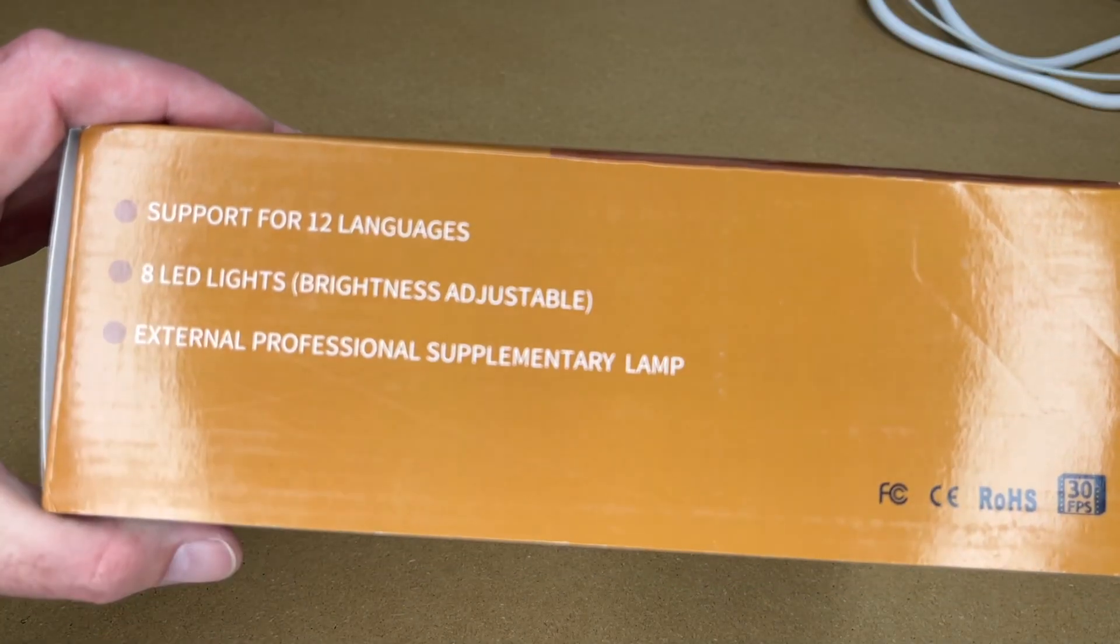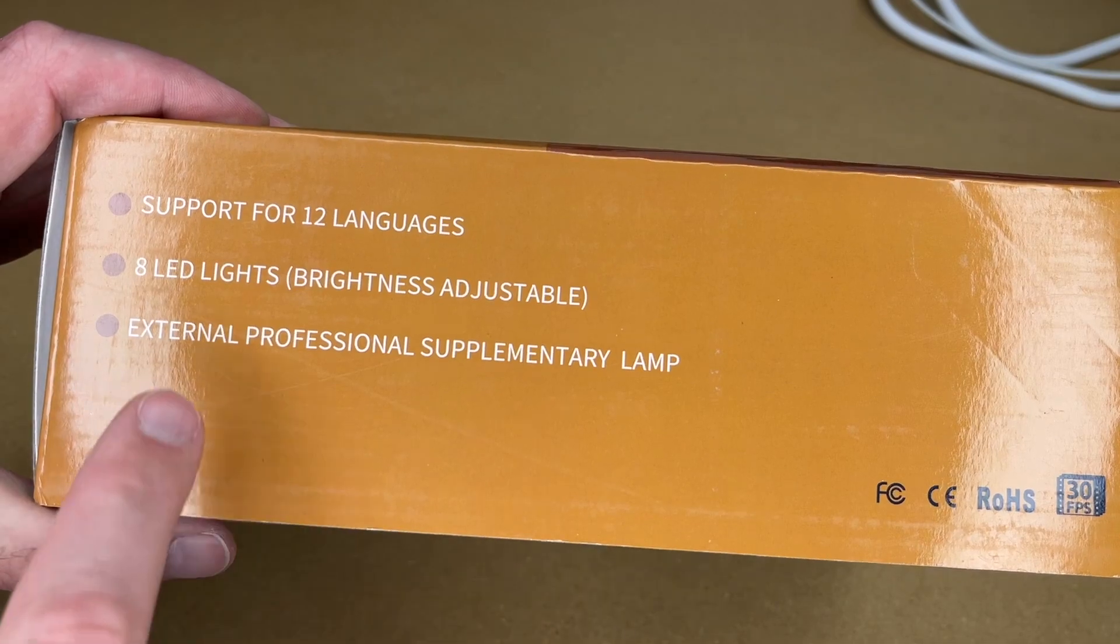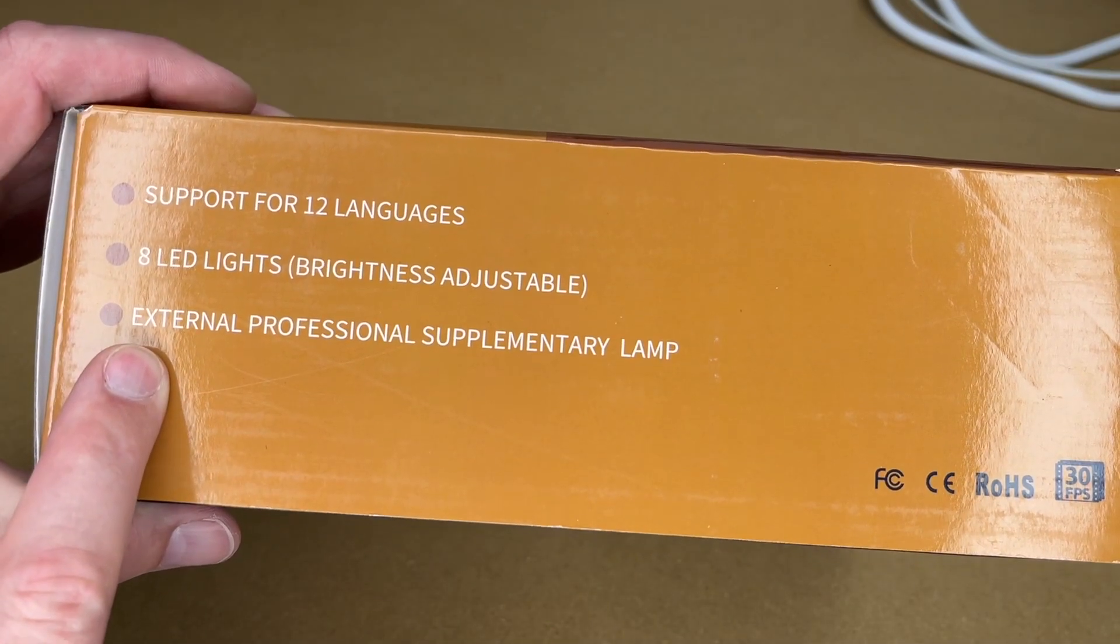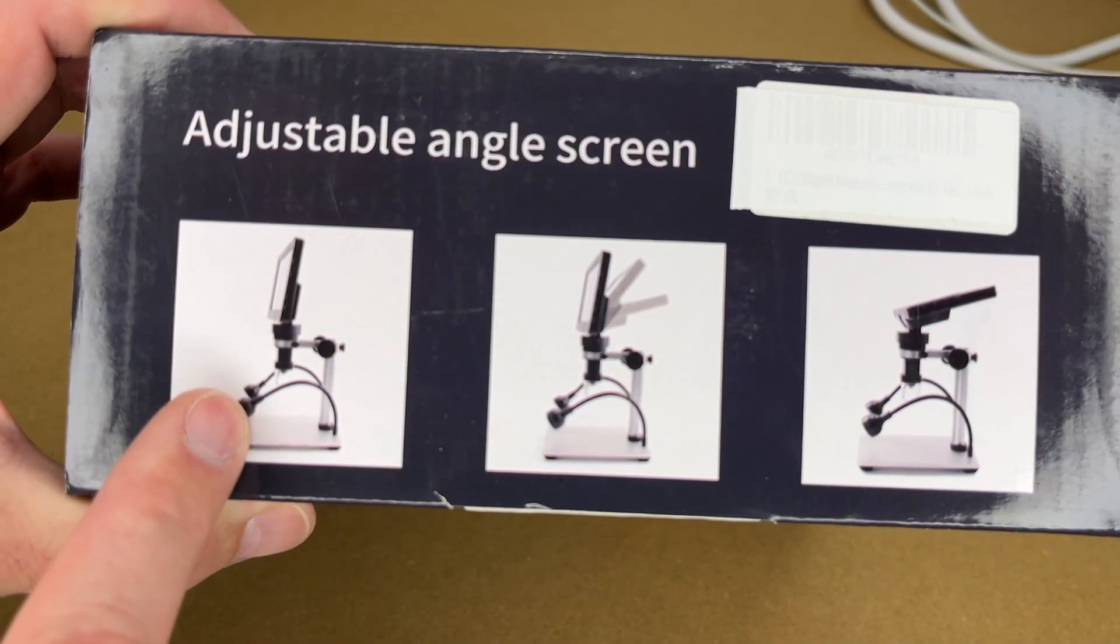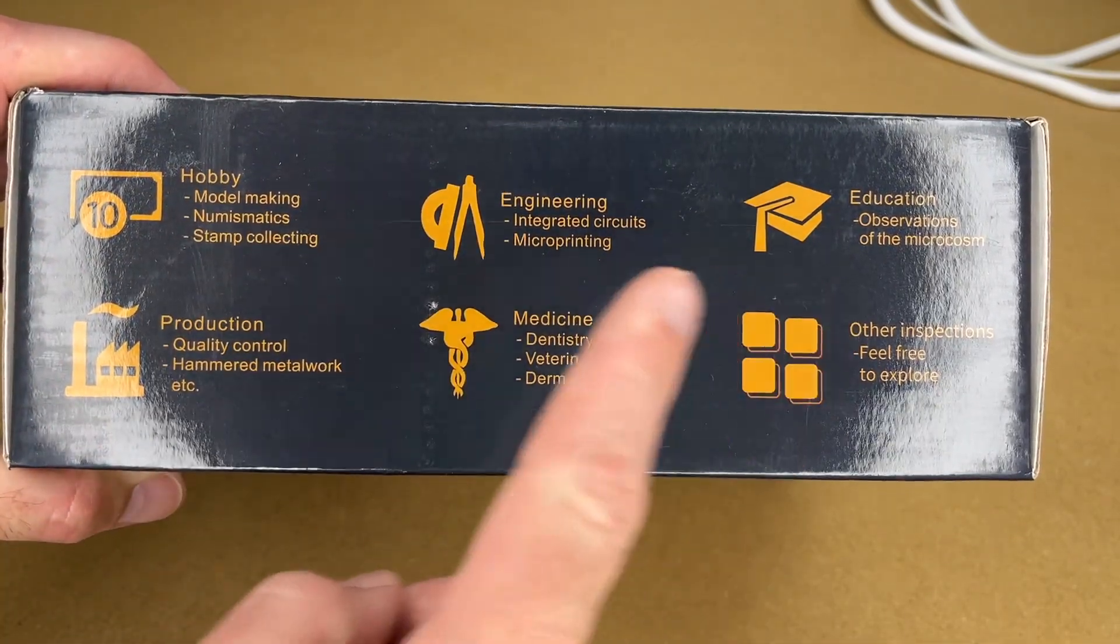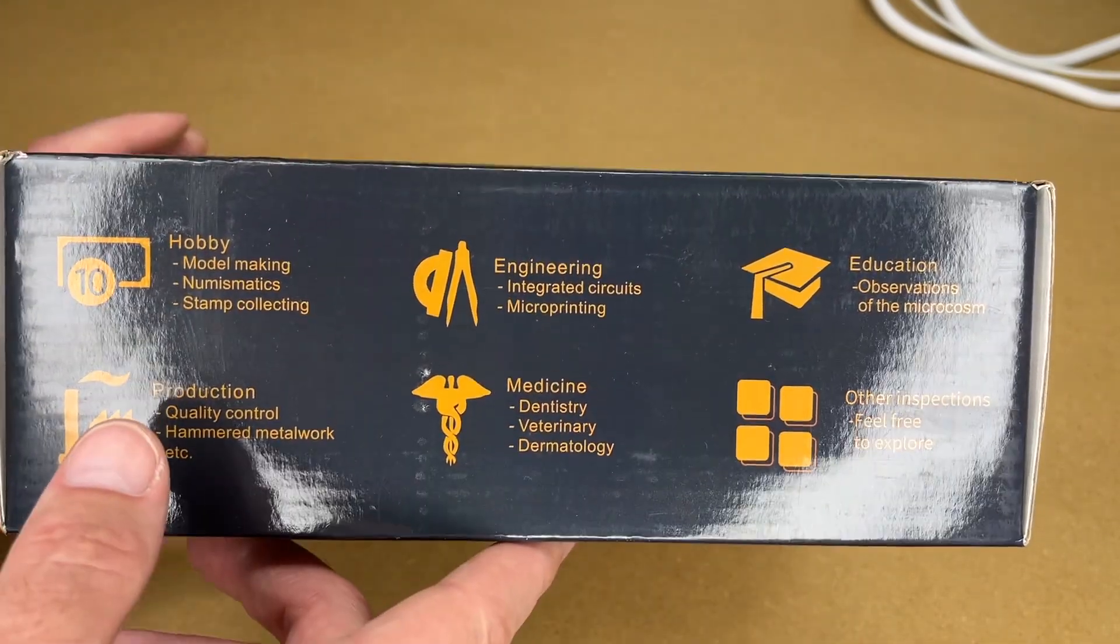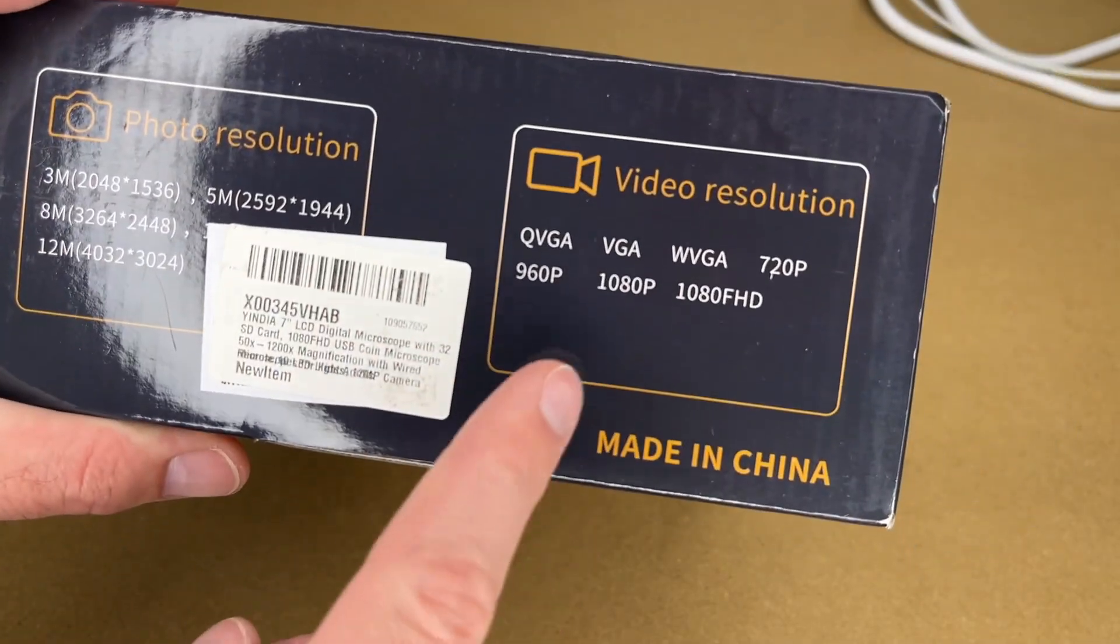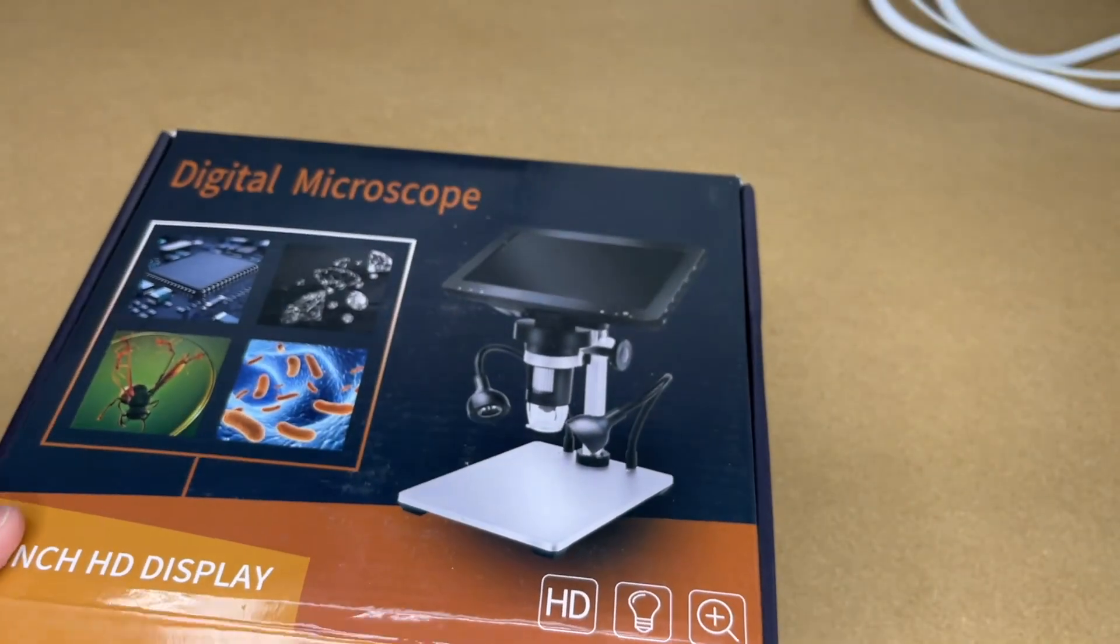So it says support for 12 languages, 8 LED lights, brightness adjustable, external professional supplementary lamp, adjustable angle screen. Here's some examples where you can use it: hobby, engineering, education, production, medicine, other inspections. Here's the photo resolutions and video resolutions. Let's take a look at this.